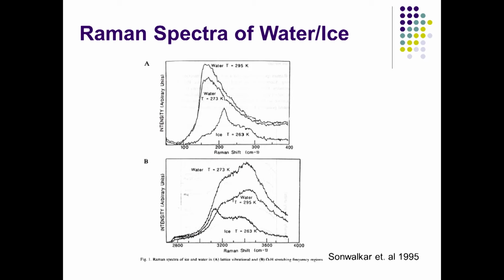So, if you look at the half power bandwidth of this peak, where we look at the peak height, and then go to the half of that and measure the size of the peak, that is how you get the average value of vibrational mode. So, we look at the half power bandwidth, and that is where we calculate how it changes over temperature as we heat or cool the substance.